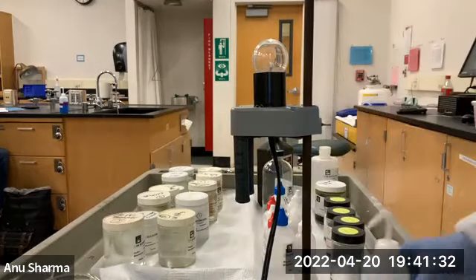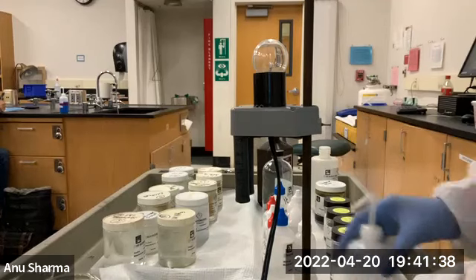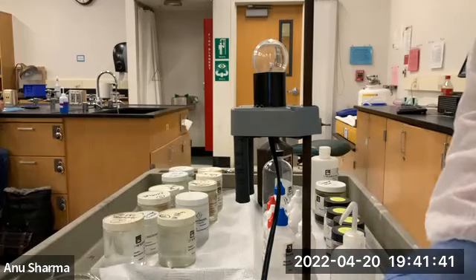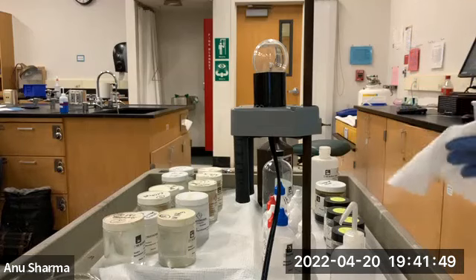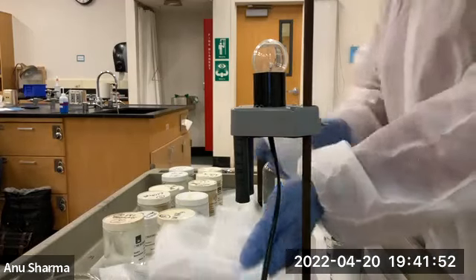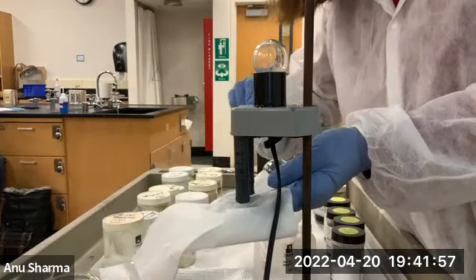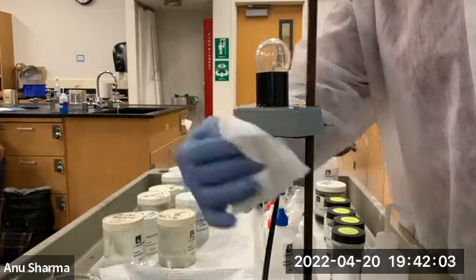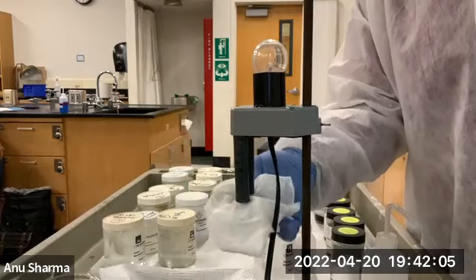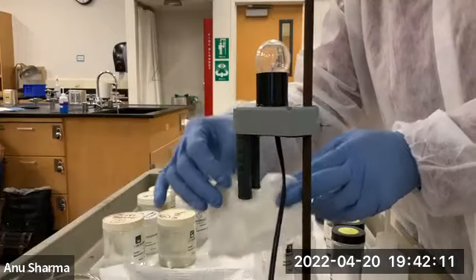Next is the acetone. Now, acetone, what do you know? We covered all this in the lectures. Acetone is CH3COCH3. What do you know about the CH containing compounds? Non-polar. Okay, the CH is a non-polar side, but will it ionize? CH is covalent bonding, so it will not ionize.